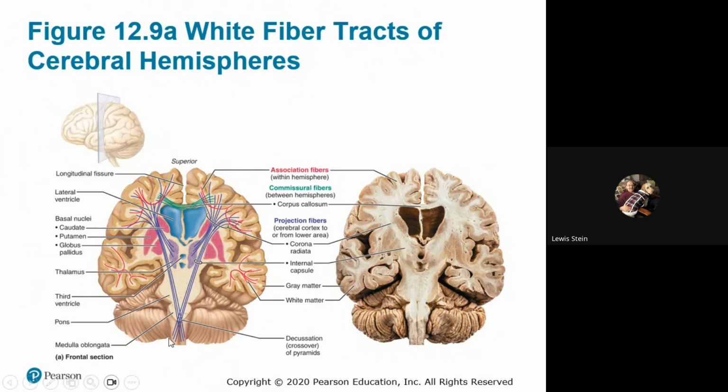Fancy name, but you're going to have to remember, called decussation. I know it's crisscrossing or crossing over, but they're decussating. Go with it. This area is where the pons is located, and it continues on through the pyramids. They're little mounds, very hard to see on the sheep brainstem because it's so small. The brainstem is maybe an inch, as opposed to ours, maybe three times the size. So here they are crossing over.